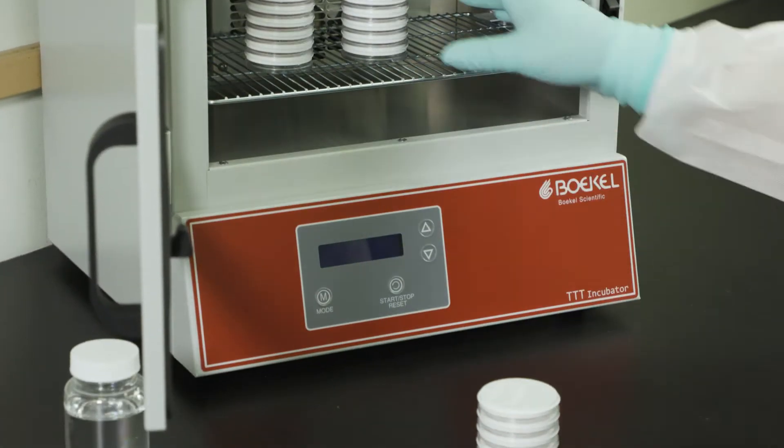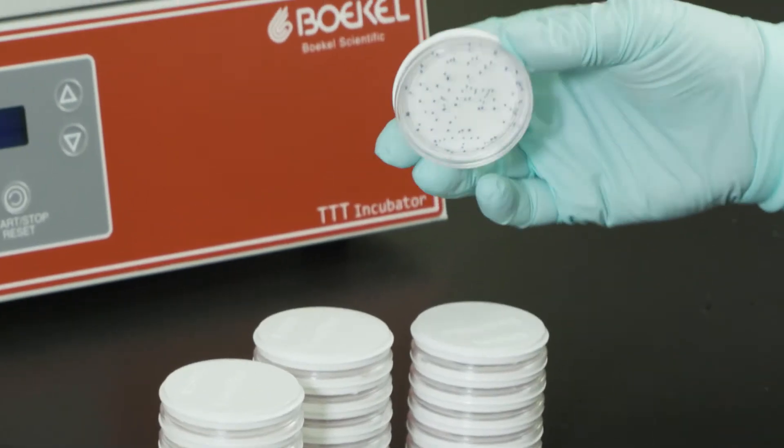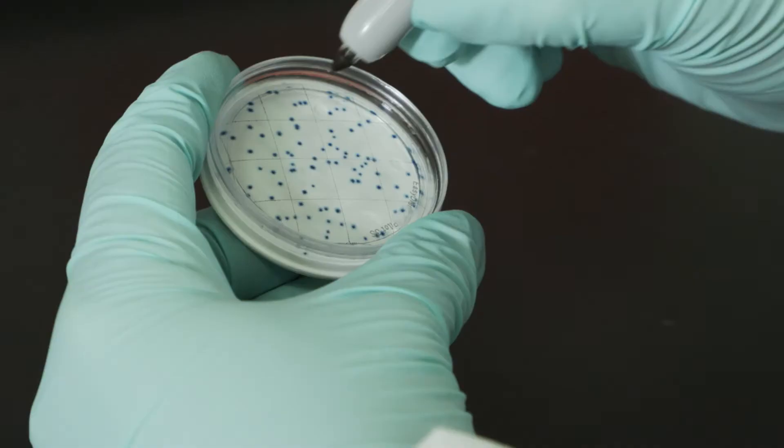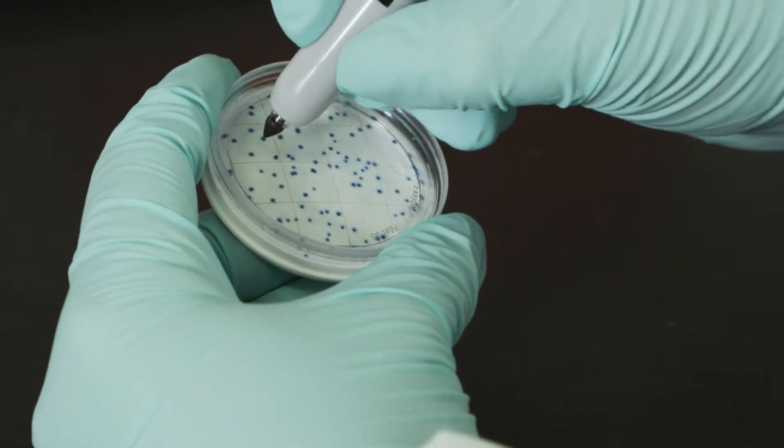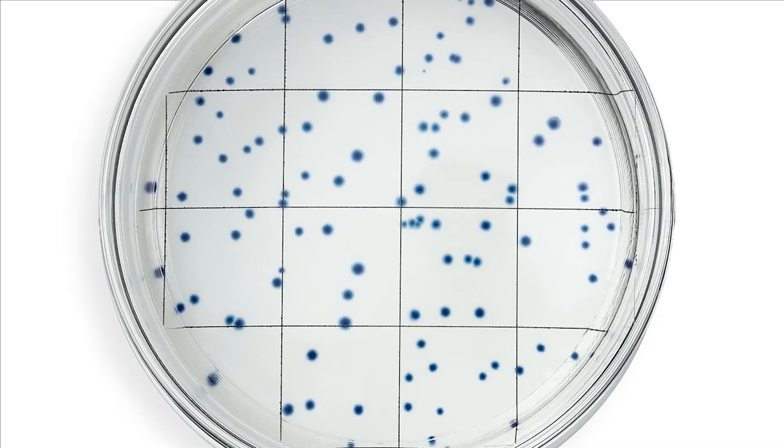Remove the plates from the incubator and immediately examine for colony growth. Sum all colonies for a result. Note that most colonies will produce a blue color and some will exhibit natural pigments. All colonies should be included in your result.